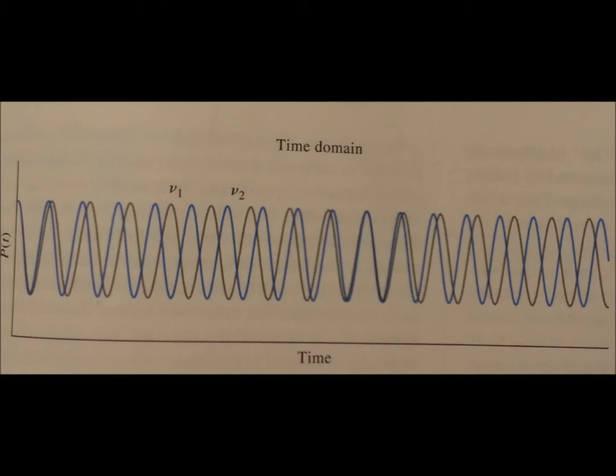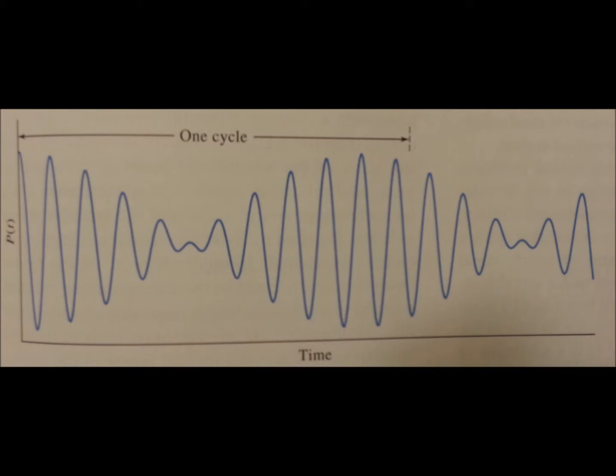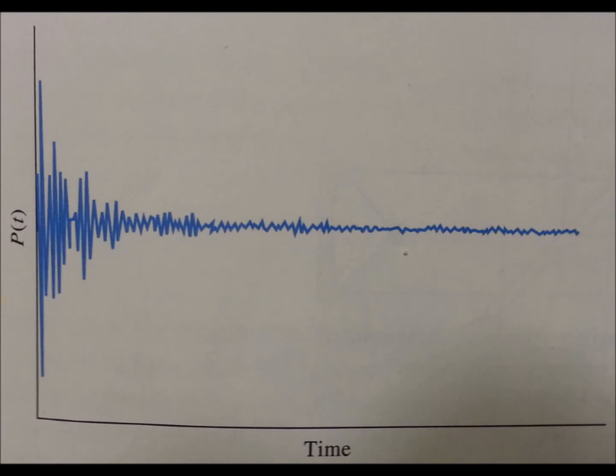When each wave is plotted on the same time domain spectrum, meaning that time is the x-axis and power is the y-axis, one notices that in some areas of the spectrum the two waves are slightly offset or constructively interfere. When the difference between nu1 and nu2 is plotted on the time domain, the effects of the constructive and destructive interactions due to the in and out of phase waves become more obvious. As time increases, the offsets between waves of varying wavelengths will become greater, and the waves will become more out of phase, leading to destructive interference. Consequently, as time increases, the intensity of the power decreases.